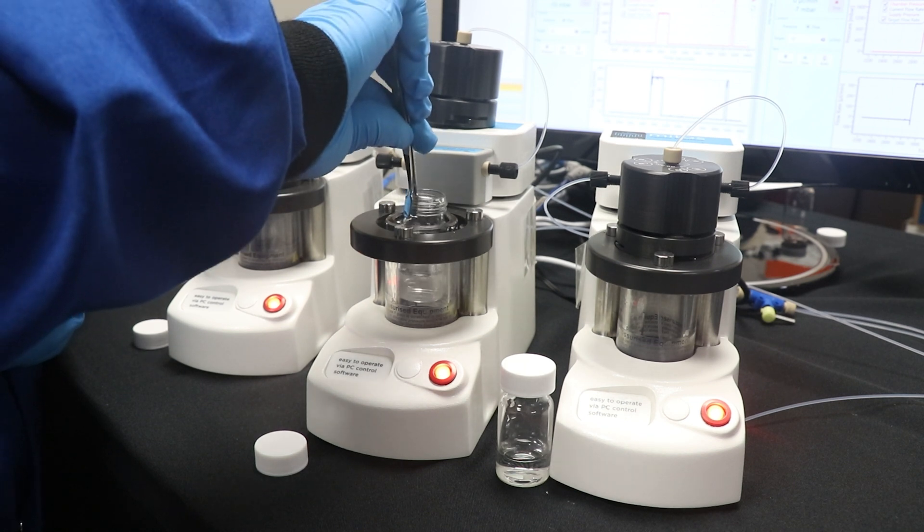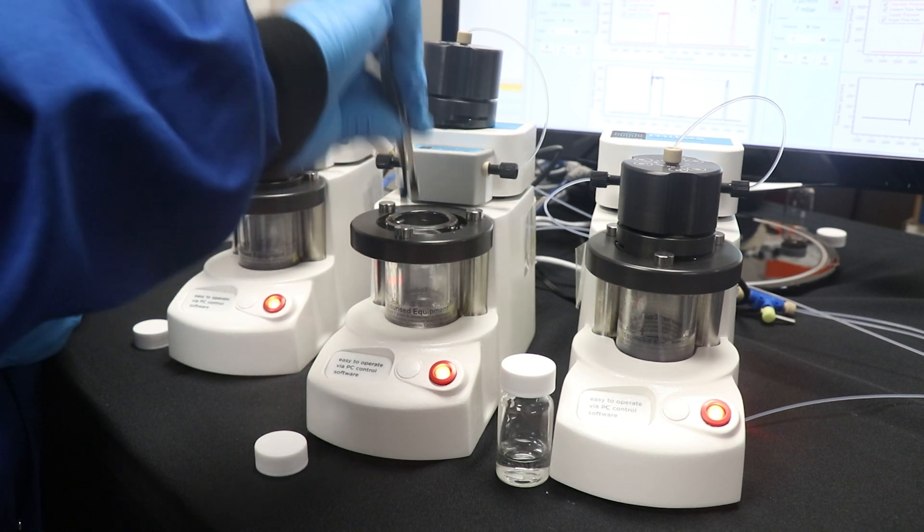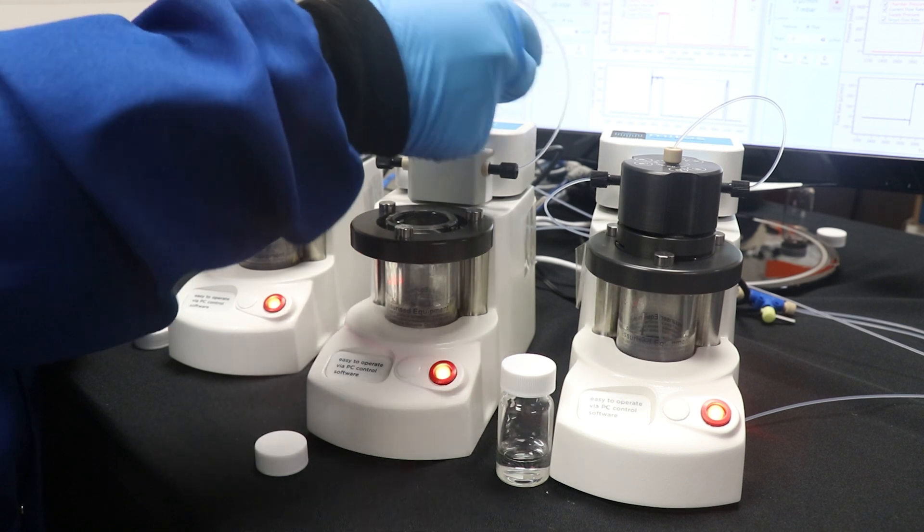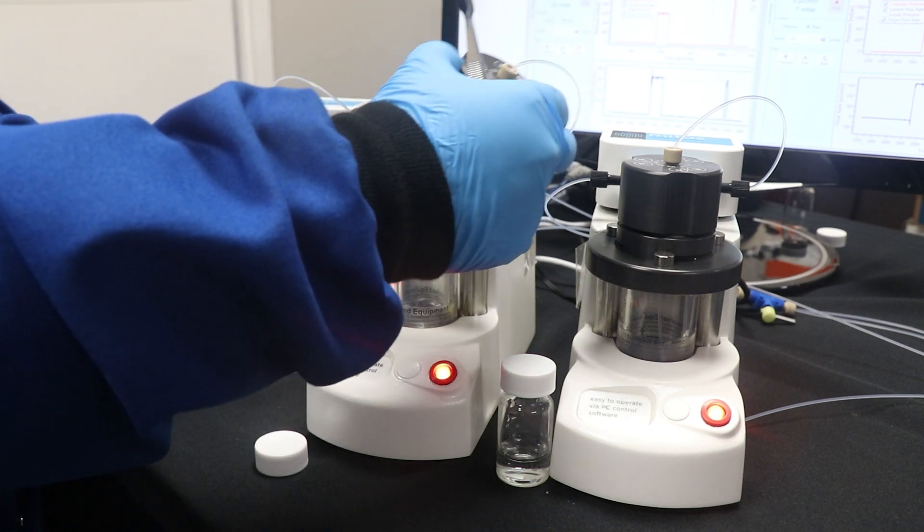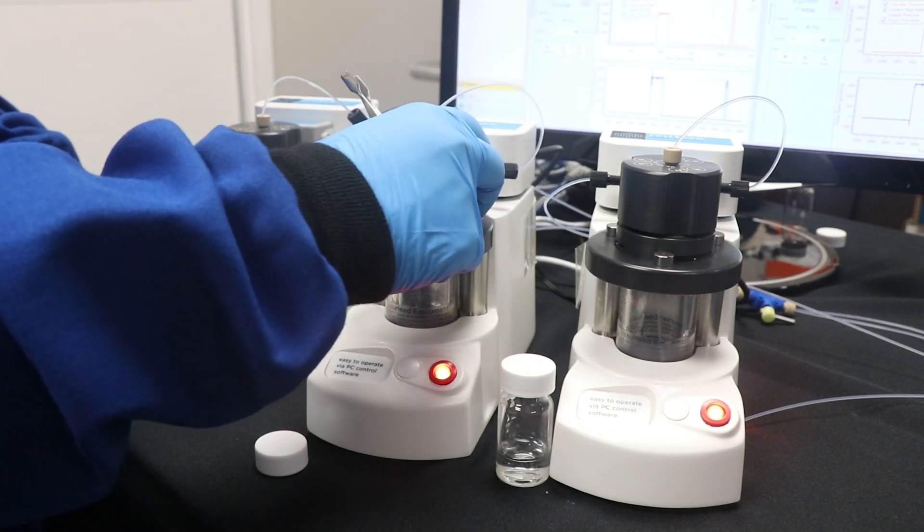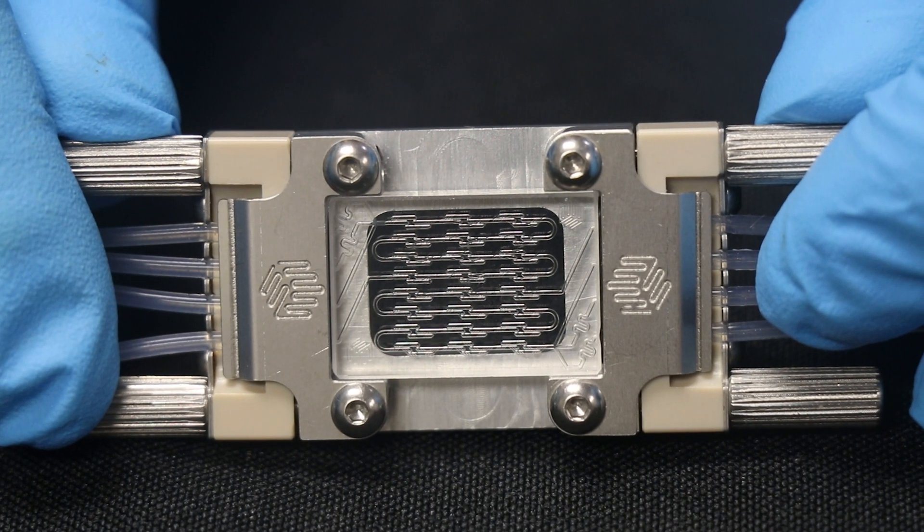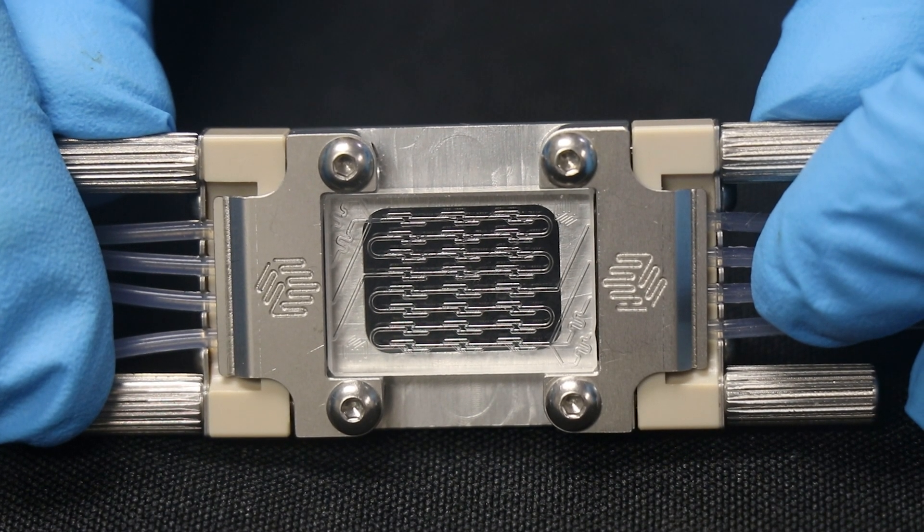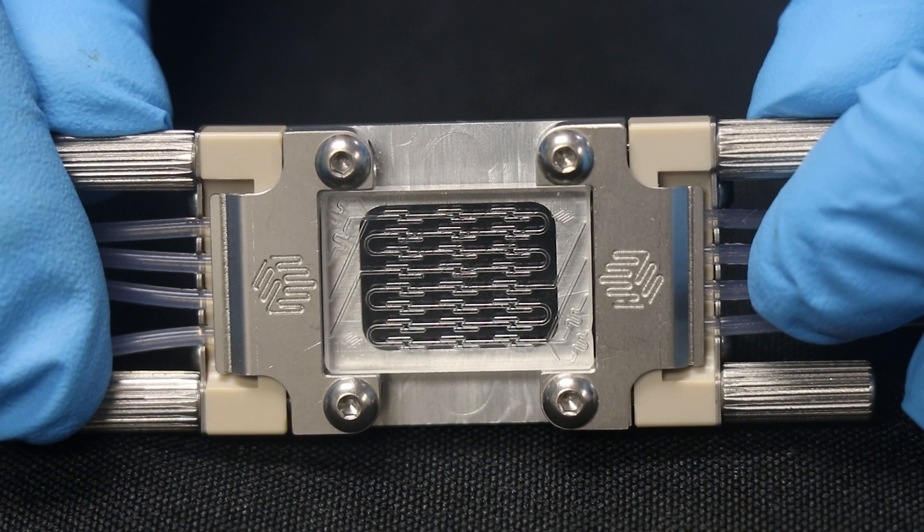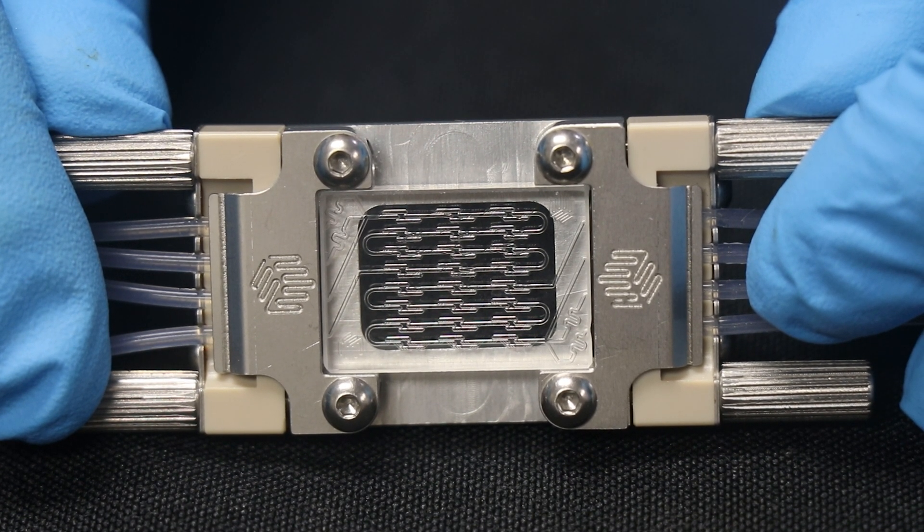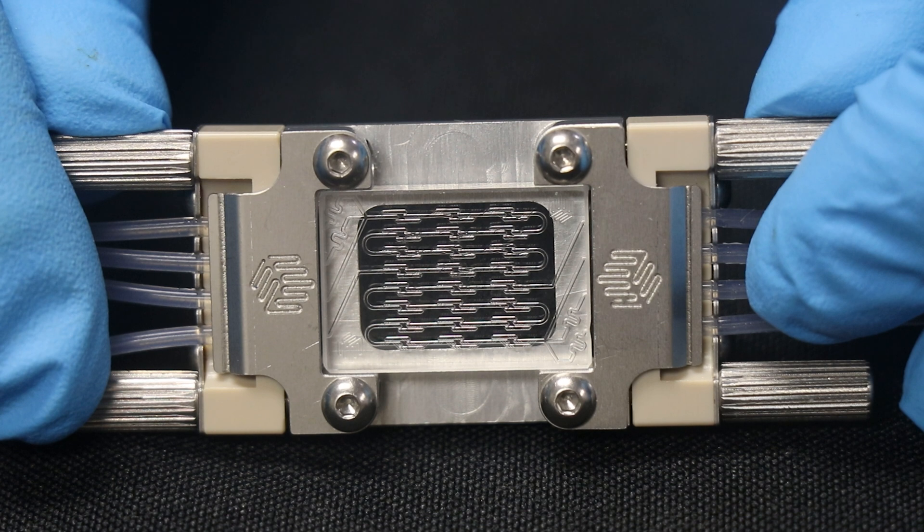Prior to initiating flow through the chip, we will tare all of our flow sensors and prime the lines. Then we will start by initiating flow on the aqueous phase, which enters the chip at the first and third inlets. Then the organic phase is initiated and enters on the second inlet of the chip.